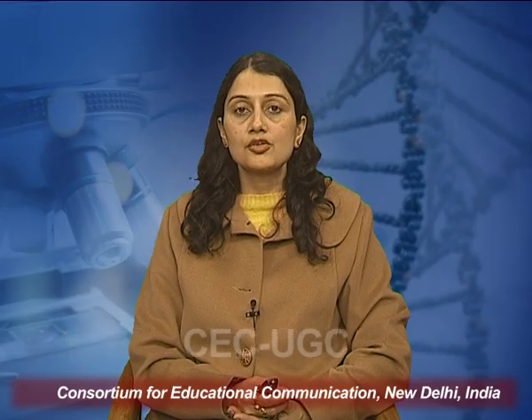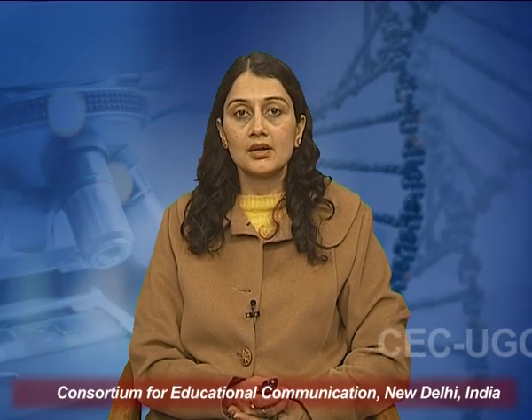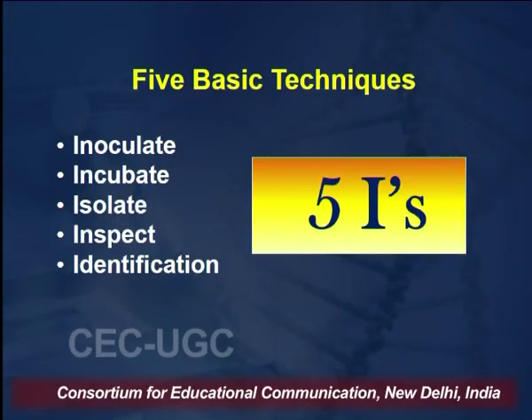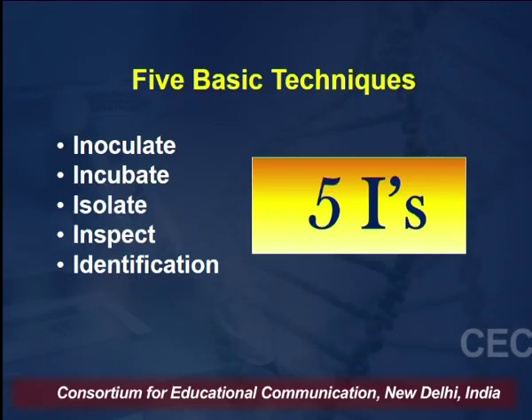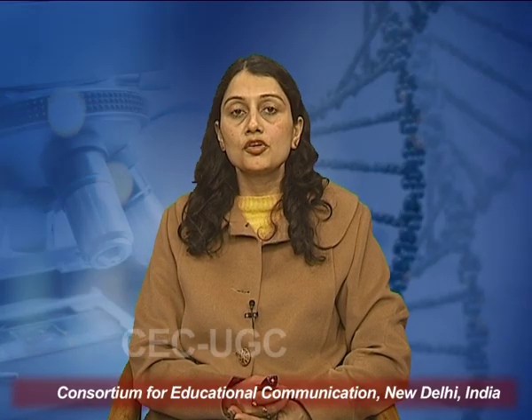The first technique is to culture them, and there are 5 ways or 5 different steps for culturing. First is inoculate. You have to select the microorganism of your interest and then inoculate in a culture media. The second step is to incubate. Each microorganism has a specific temperature and pH on which it can grow and thrive. So you will incubate your culture at that pH and temperature for a prolonged period of time, such as 12 to 16 hours. So that is called incubation.